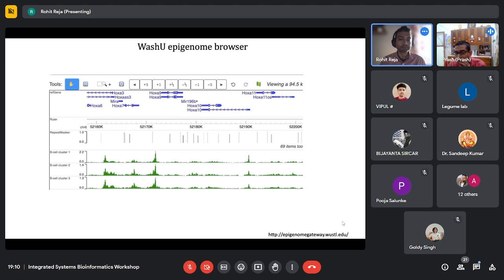Right, wonderful. And this browser, for example, is this also comparable, in terms of the girth of that particular graph or the peak, with MeDIP-seq or CLIP-seq based approaches, where we perform cross-linking immunoprecipitation? Is it really the same? Because we largely work on CLIP-seq, Rohit.